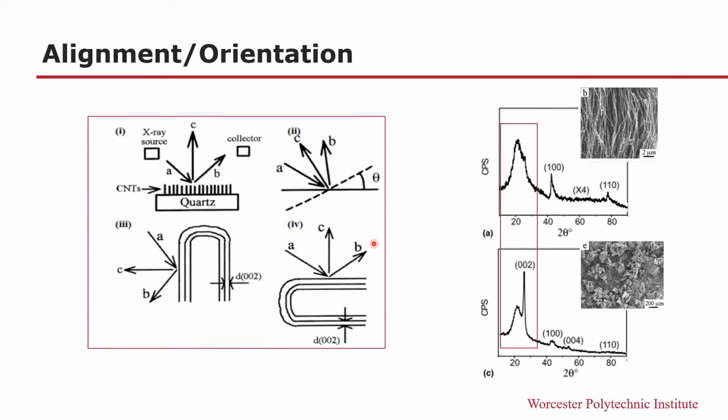Note that only upward scattered diffraction can be measured by the sensor. Thus, the 002 peak will decrease significantly as the nanotubes are better aligned. This is seen here, where the aligned specimen has a much more diffuse peak than the randomly aligned specimen, which has a much sharper peak.